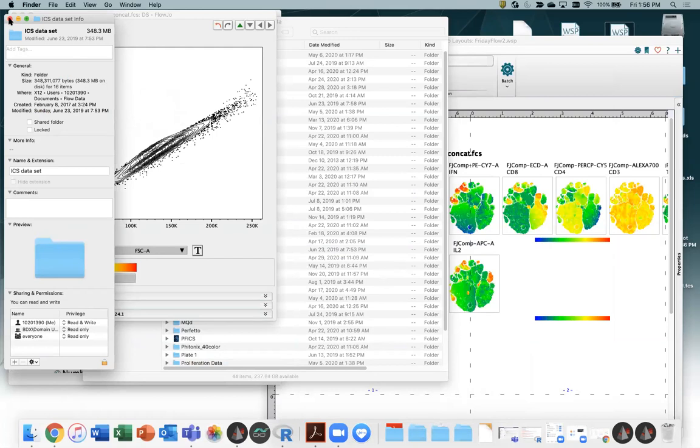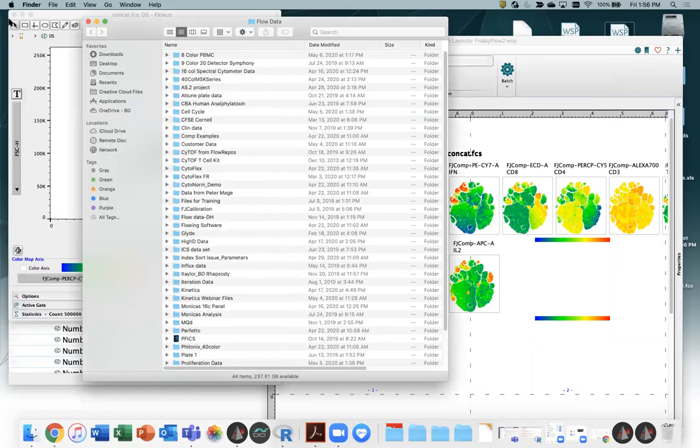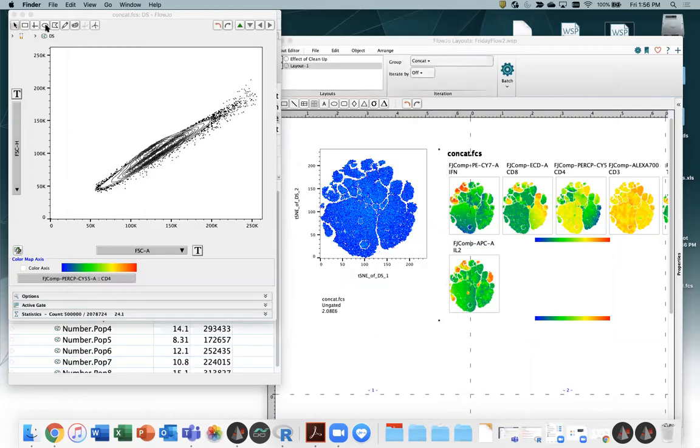Cool. And so, I'd want to have definitely at least that much RAM multiplied by, you know, 1.5 or something like that, because the computer operating system is going to take up some amount of that memory just to have power on and be showing you your desktop and so forth. So pretty much more is always more.